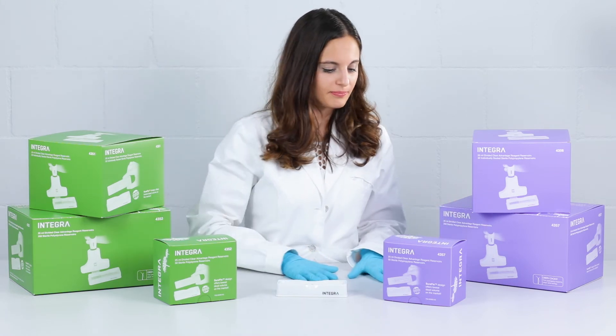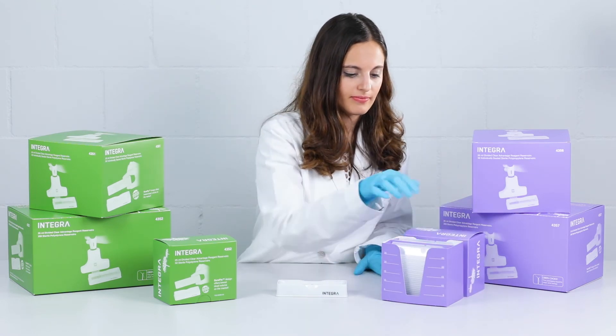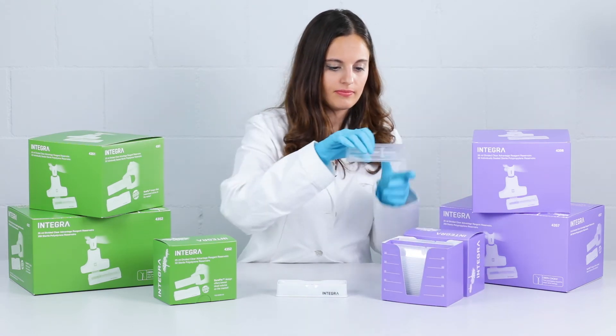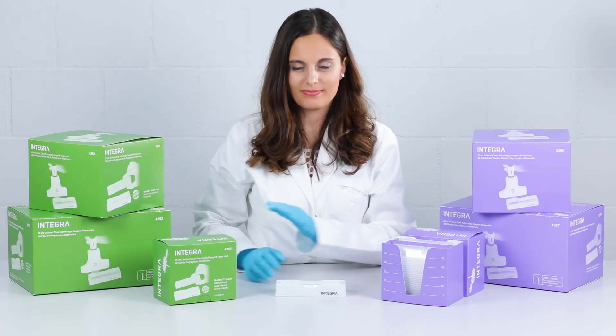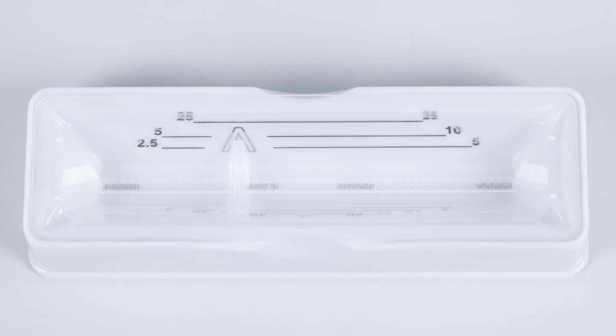Both offer the same benefits as Integra's popular line of multi-channel reagent reservoirs. They fit within a sturdy reusable base and feature clearly visible integrated volume graduations for ease of use.